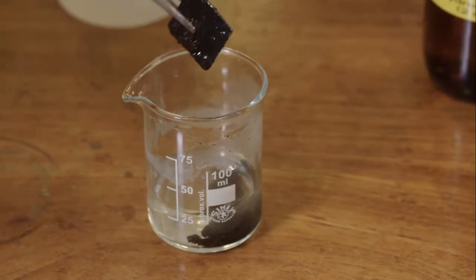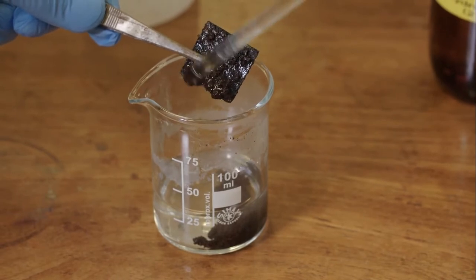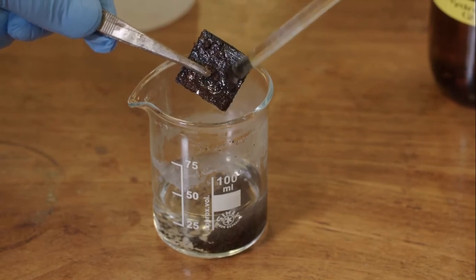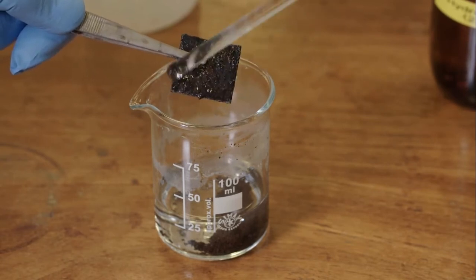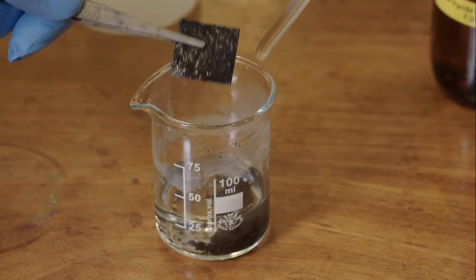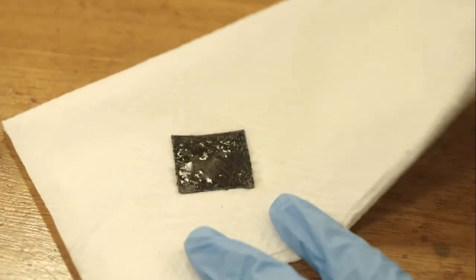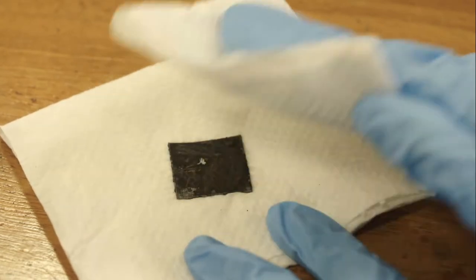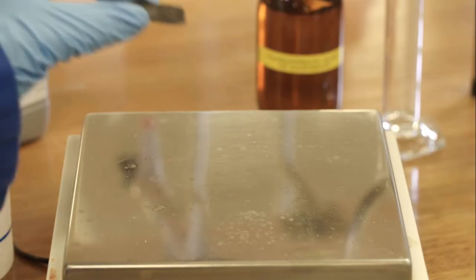Using tweezers, the zinc is carefully removed from the beaker. Scrape the zinc piece with the glass rod until no more copper is present. The zinc piece is dried with a paper towel. Then, its mass is recorded.